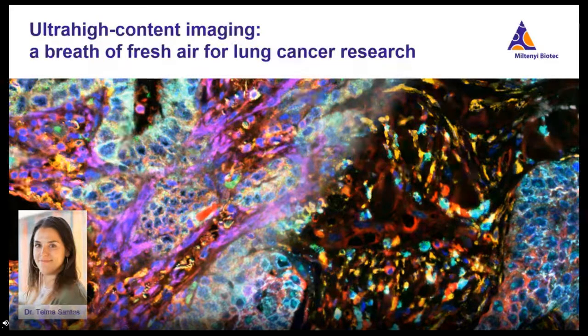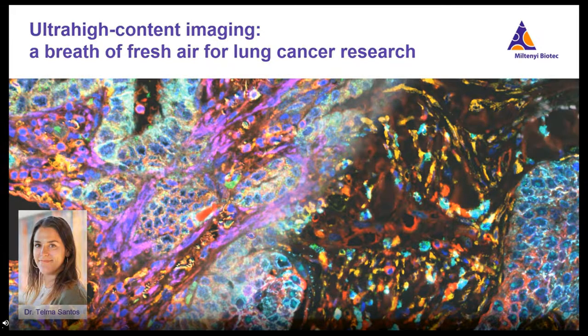Hello, and thank you for signing up for this webinar. In a previous webinar, my colleague Stefan Eulitz presented next-generation ultra-high-content analysis of the tumor immune microenvironment using MICS technology, and I would highly recommend you see his presentation as well if you are interested in ultra-high-content imaging focused on the tumor microenvironment. In this presentation, I will focus on the potential of the MICS technology in lung cancer research, and I will give you some strategic approaches on the analysis of such data sets using our own QI tissue image analysis software. I hope you enjoy it.